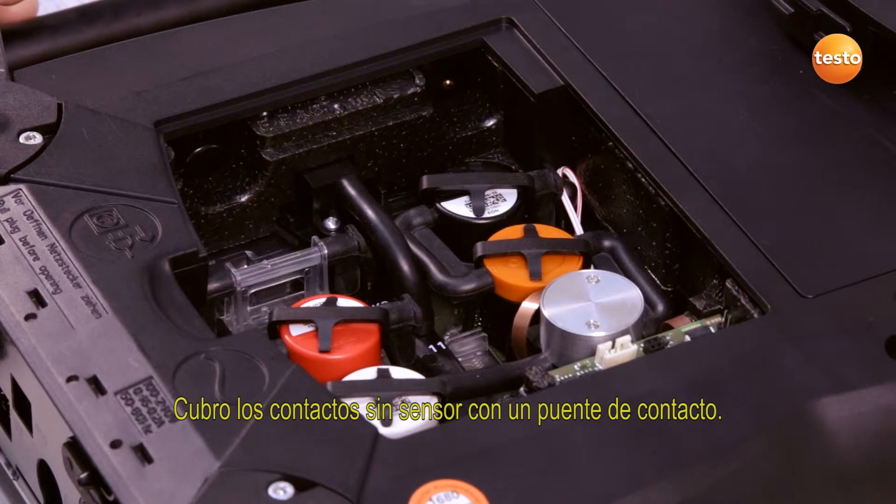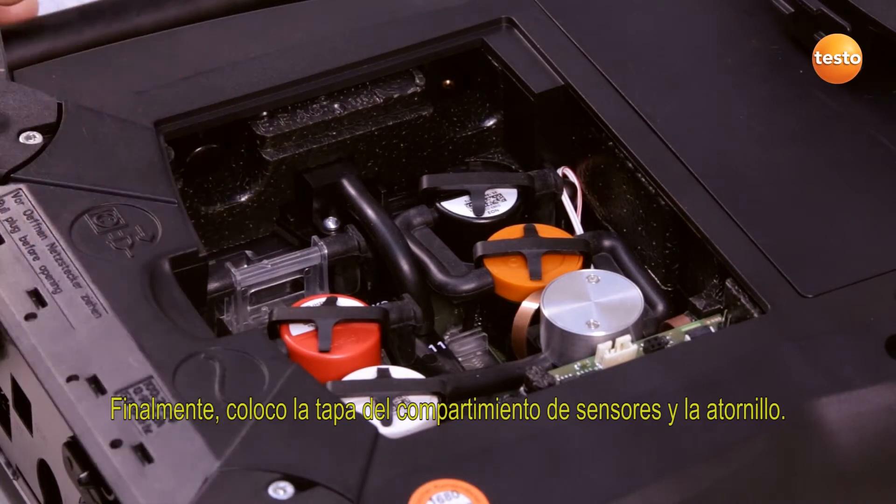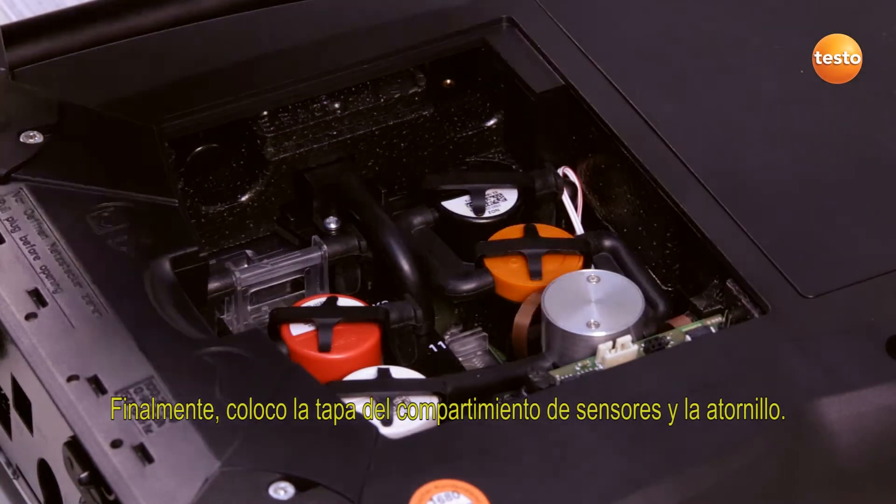I insert a slot bridge for slots which are not equipped with the sensor. Finally, I replace and close the sensor compartment cover.